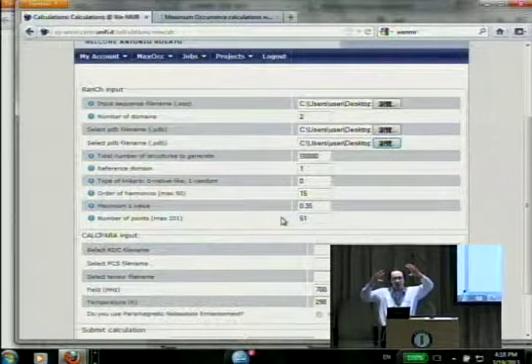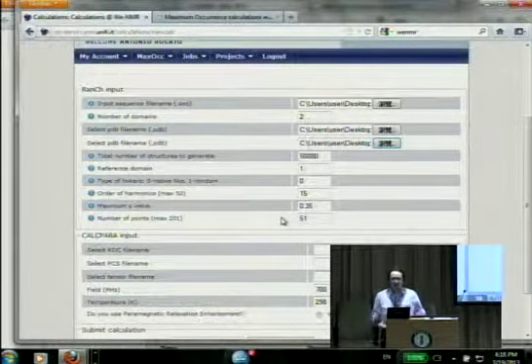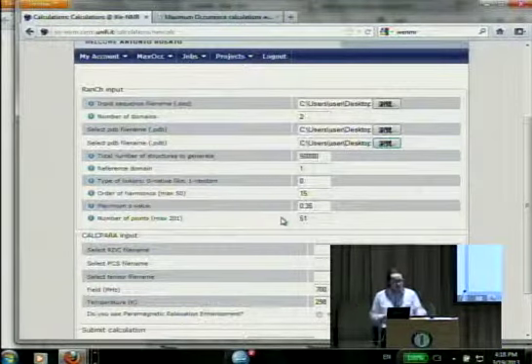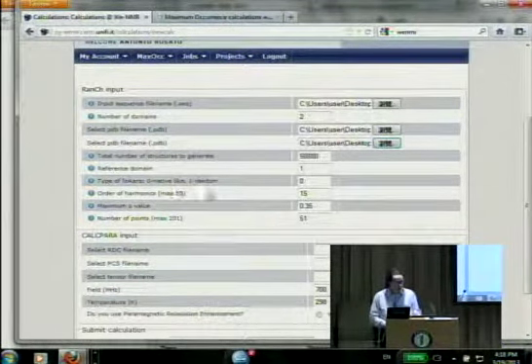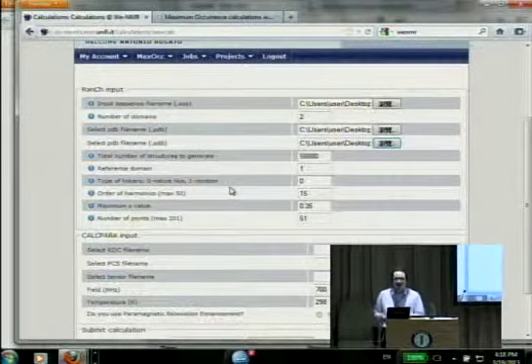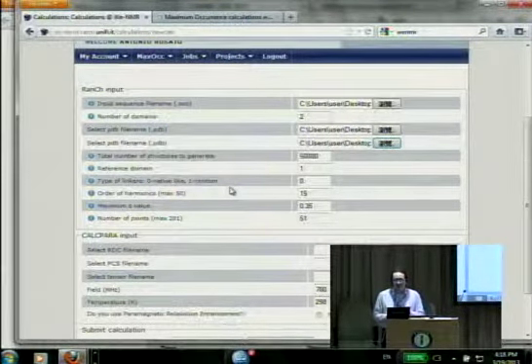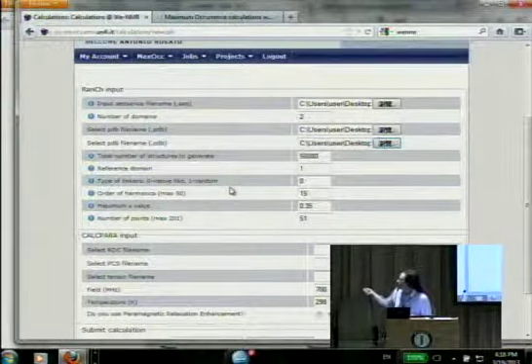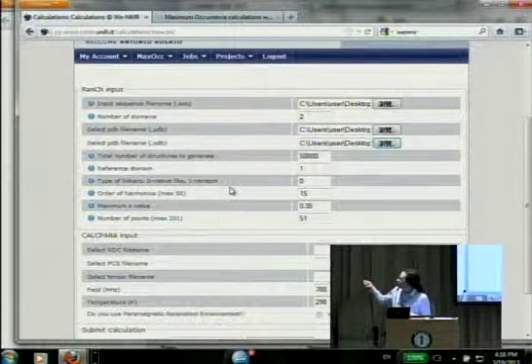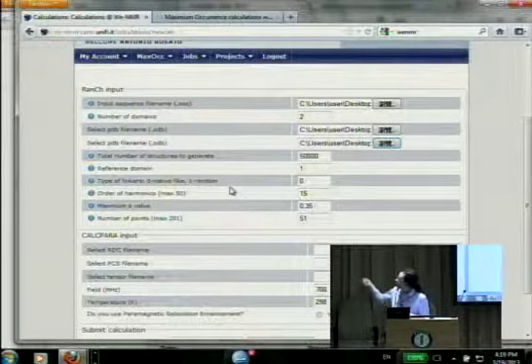By looking at the sequence in the 2 PDB files provided, with respect to the sequence of the entire protein that you gave as the first file, the program will automatically guess which are the residues forming the linker region. So it's by subtraction, okay? You have some residues in the first PDB, some residues in the second. This is the entire sequence. What's missing here is by default the linker.